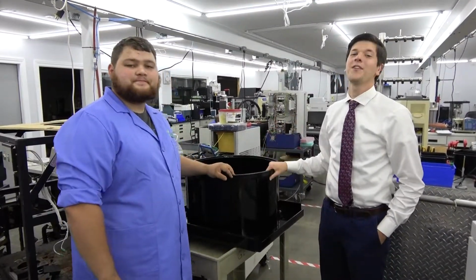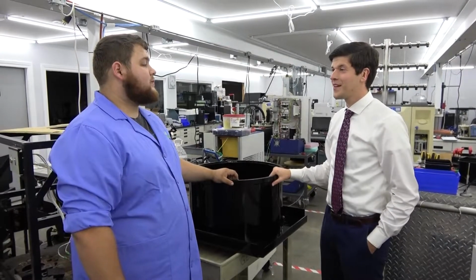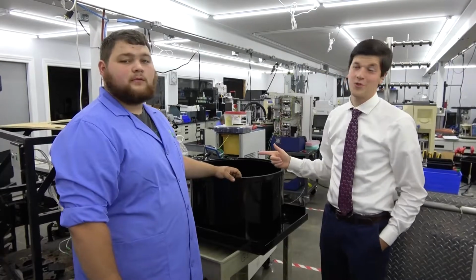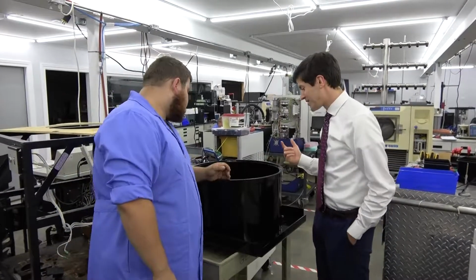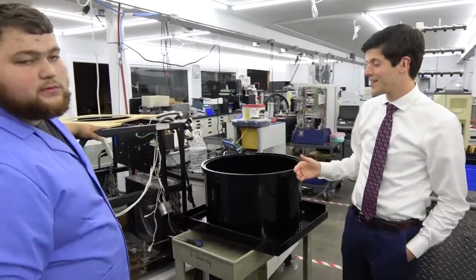How's it going? We are in the new Life Scientific Tech Shop. We got a little off track. We haven't done a video for quite a while, but we're going to show you the guts of a Sorvall centrifuge today. Rob is doing some work on it, and so I'm going to let him take the floor and tell us what he wants to tell us about this thing.